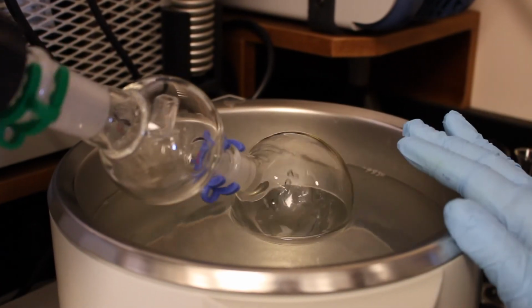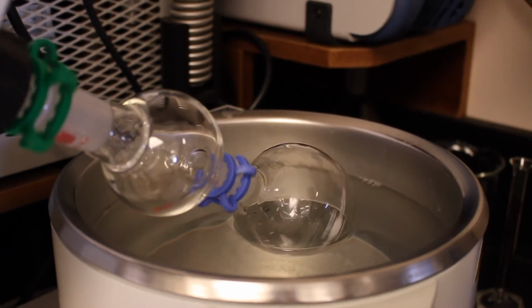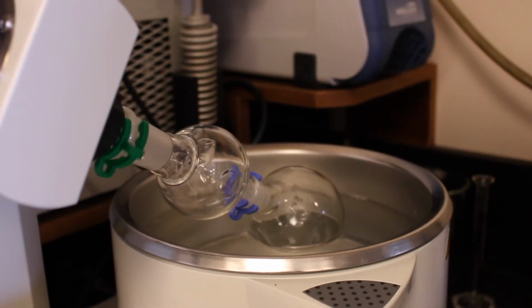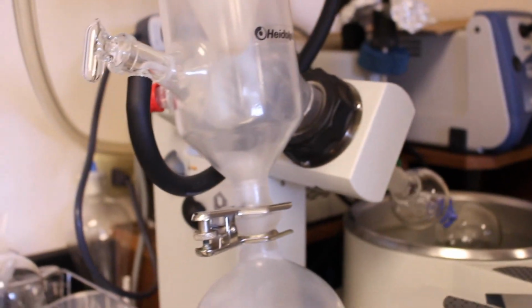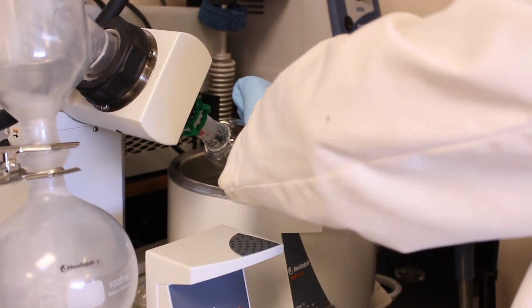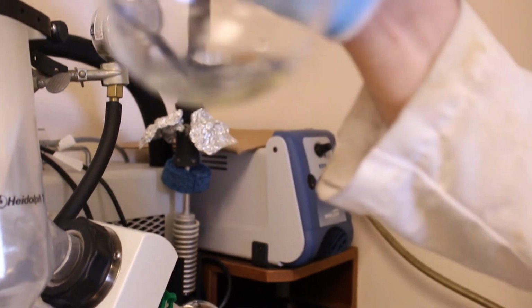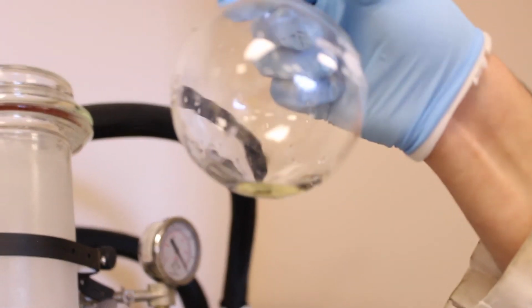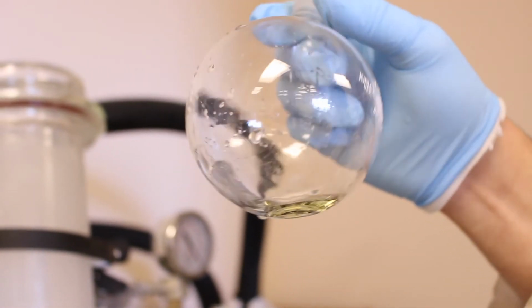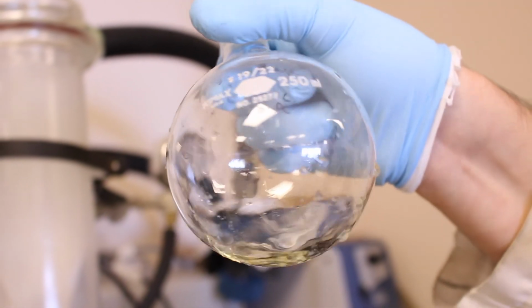Alright, so we've left it on the rotovap for a few minutes, so now we can turn off the vacuum pump. So that'll hopefully make it a little less loud, and we can open up the apparatus to the atmosphere, which will vent it, and then now we can take the flask off the rotovap. And now you can see that we just have a little, oh, let me wipe the bottom of it. We have a slightly yellow runny oil, which is hopefully our eugenol. So we'll dry off the outside of the flask and put it on the balance.